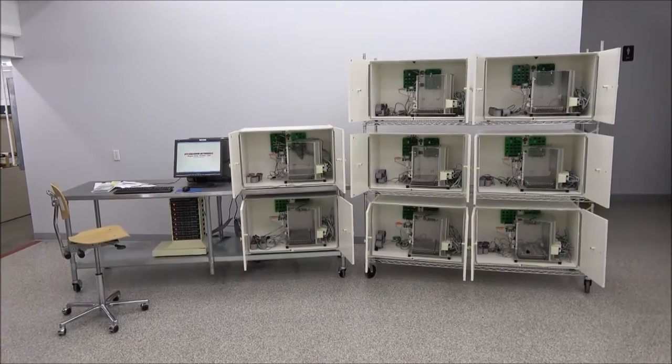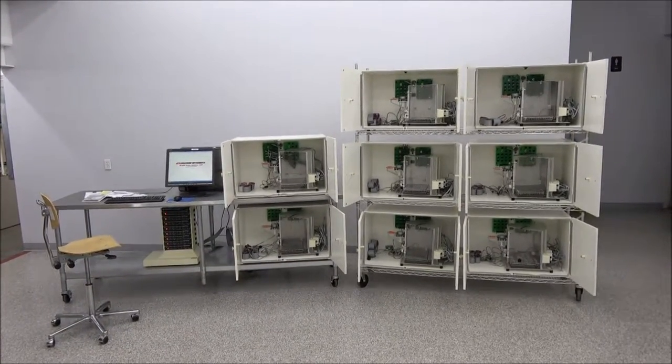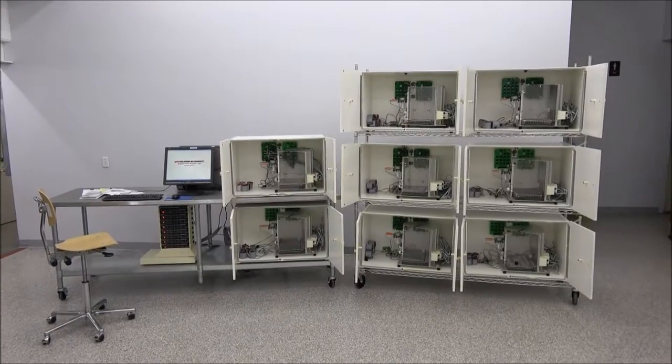Hi, this is Rich with New Life Scientific, and today I'd like to show you another Colburn Habitat System that we just got in. It's a very nice, very clean system.